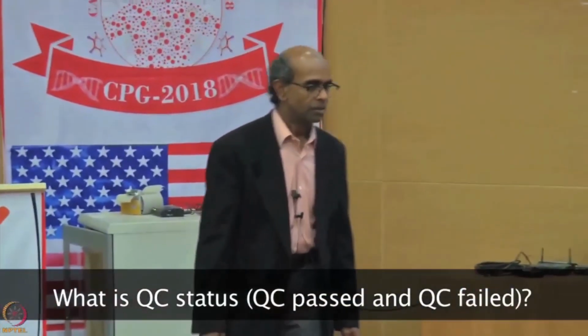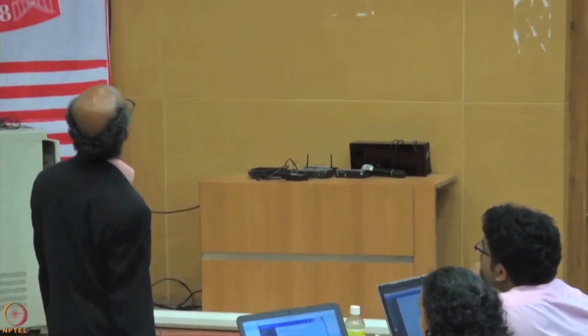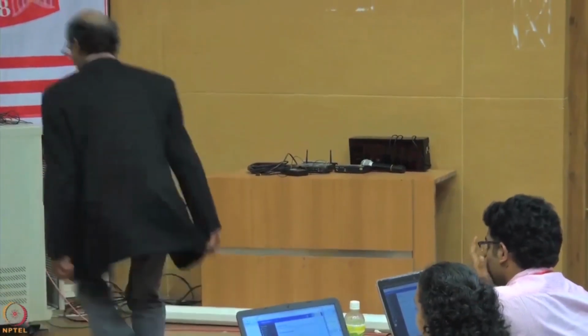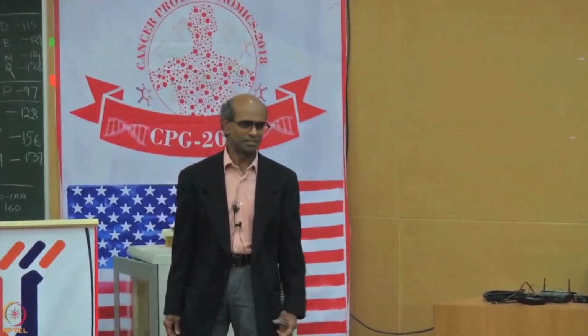What would that status mean? QC pass fail. Yeah, so we use QC pass fail to decide which ones to include and which ones to exclude. In the breast cancer paper, there were a set of samples that we excluded, and those were marked as QC fail. The criteria are relatively complex, so you have to read the paper. I don't want to go into it, but we can talk later if you want. There are two QC status columns, and both are the same. I think that was because of some processing, and it was included multiple times. It's the same thing. It's possible one might have 0, 1 and the other one has QC fail, QC pass, something like that.